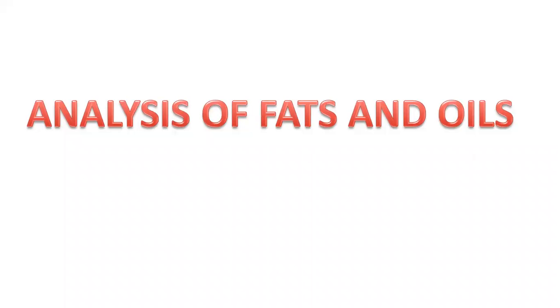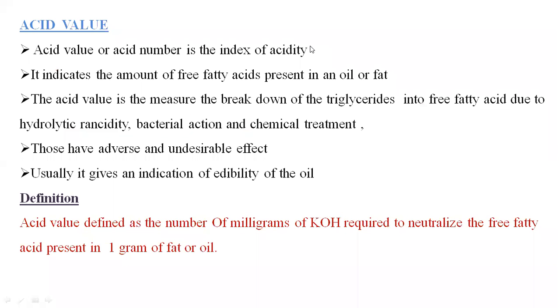Analysis of fats and oils. Here we are analyzing the fats and oils based on some constants and values to determine the quality of the products of the fats and oils. The first constant we are going to discuss is acid value.